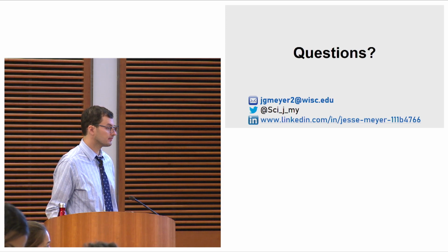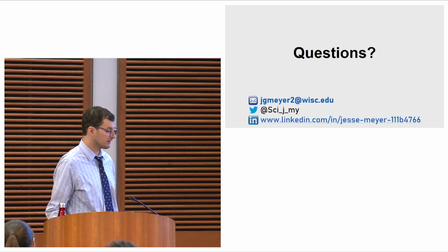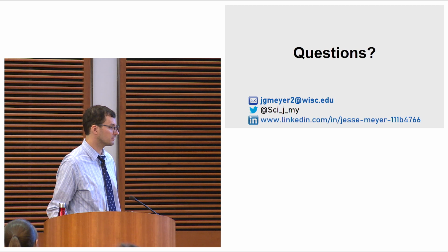Thank you very much for a really nice talk. I'm wondering about this method that you mentioned about PTMs, where you could really correct PTMs for protein expression. But what is the overlap between proteins and PTMs in your samples usually? That's a good question. I can tell you a lot of the PTM sites you don't find the protein for when you do a parallel analysis looking for protein. I don't know the exact number, but usually I just throw out the ones that I don't have a protein measurement for, because I really want to know the relative PTM amount, not just whether the PTM changed.